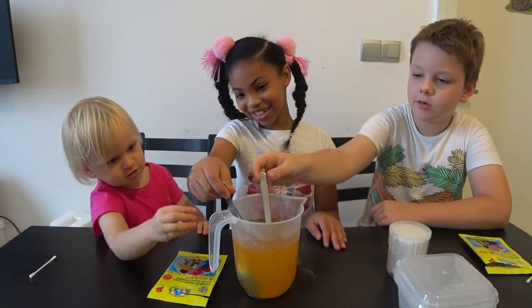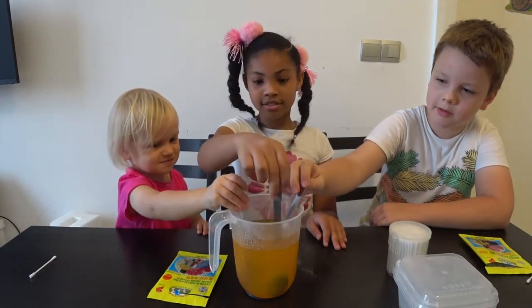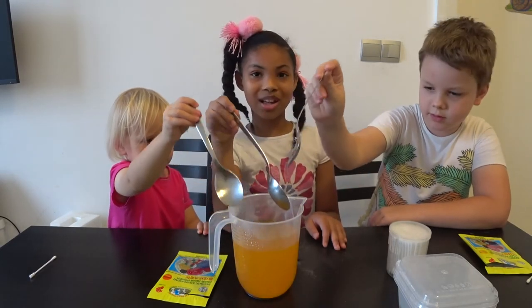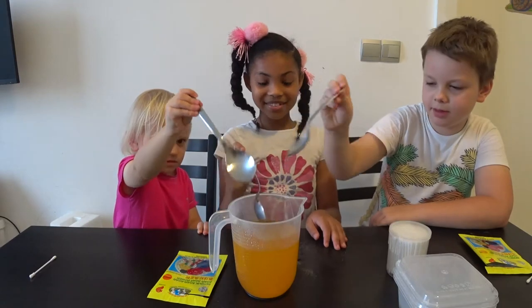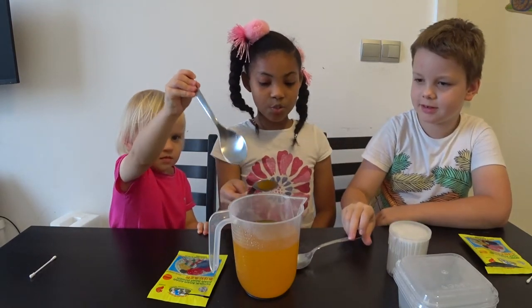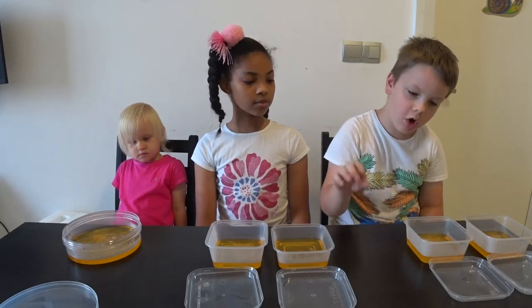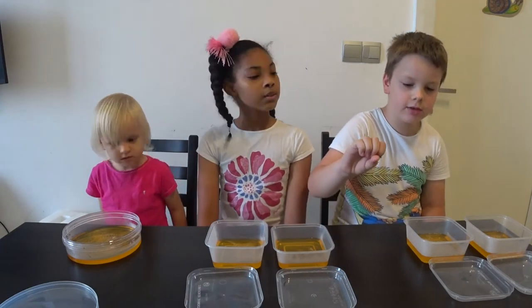And now we already mixed it, so now we need to put it in the microwave. Ask your parents for help. Yep, that's two. Don't put the spoon. Now we poured the hot agar-agar into the boxes.